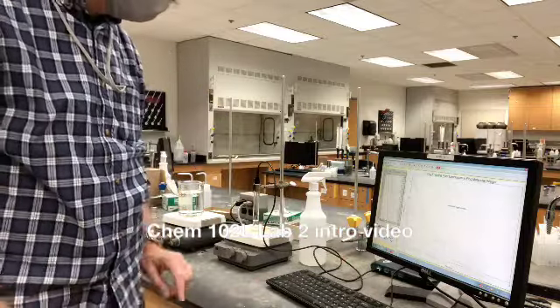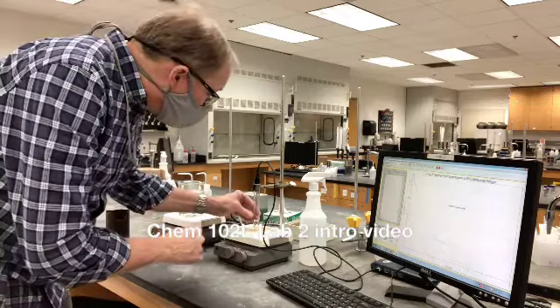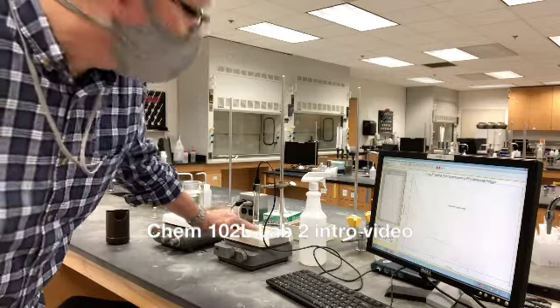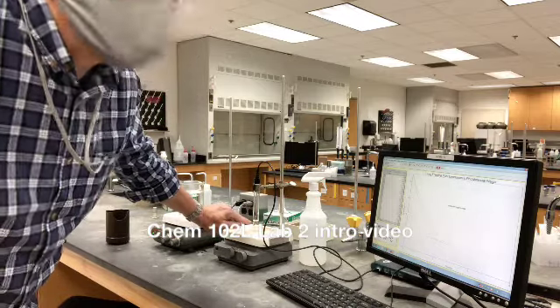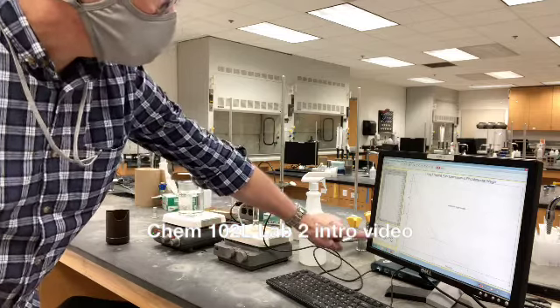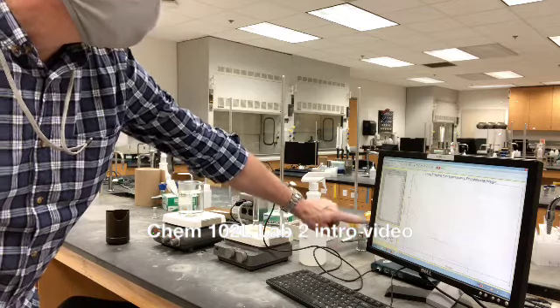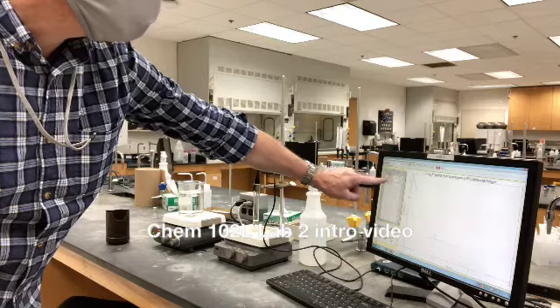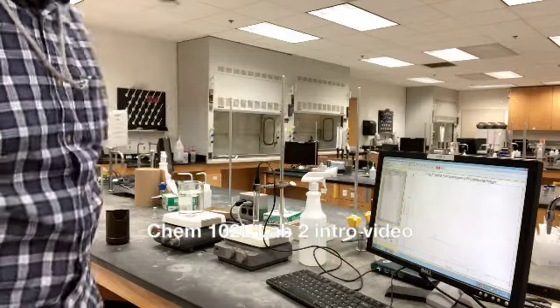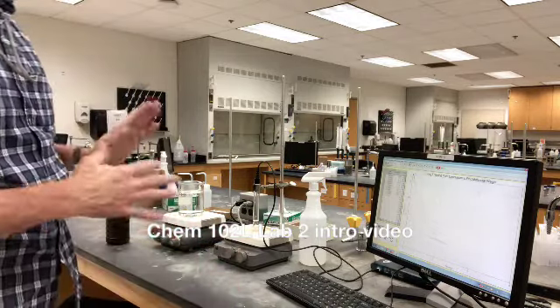and we're down to 51 degrees, and our tube is sitting here above the stirrer. It's a liquid because it's above its freezing temperature, and we're about to get 50 degrees. So we're now cooling. We've dropped below 50, and now I've started collecting time and temperature, and a new curve is showing up on my screen. So this is the process by which we're going to watch for a freezing temperature.